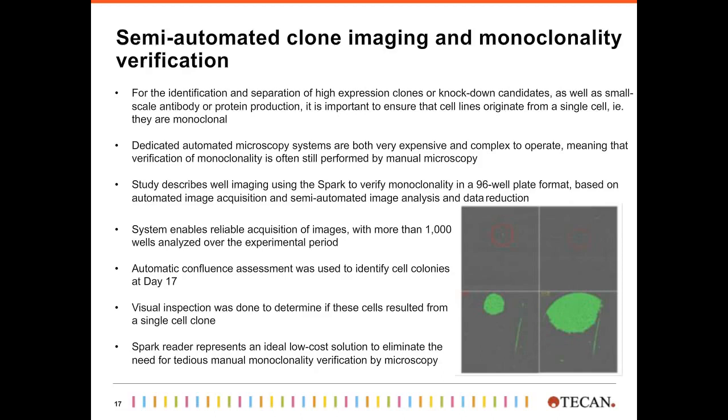You can automatically record the images as the system can make whole well images. You can then, after a couple of days, easily track back to find single cells in a well. So the image resolution, the image quality is good enough to also support these kind of applications. Certainly, it's something in between the manual approach and a dedicated system for clonality verification like the CSI from MD.